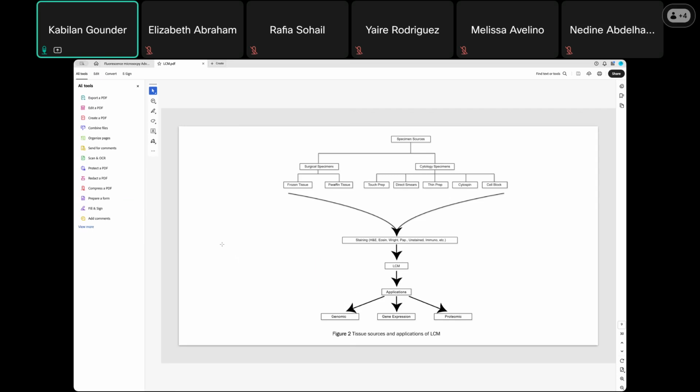That's the most important thing here. Your goal is to look for the structure or target. If you are interested in studying further at the biochemical or molecular level, you have to isolate those particular cells of your interest.